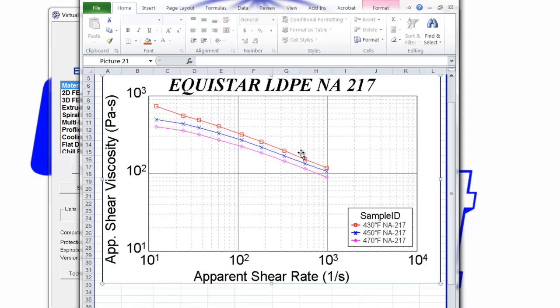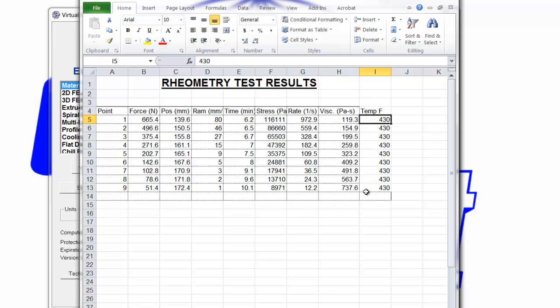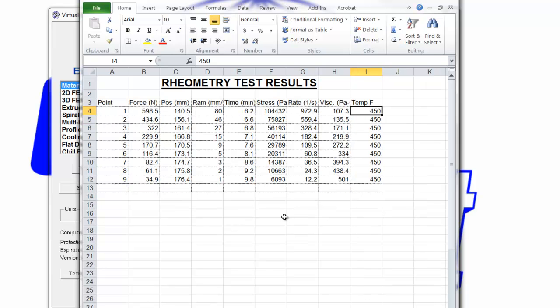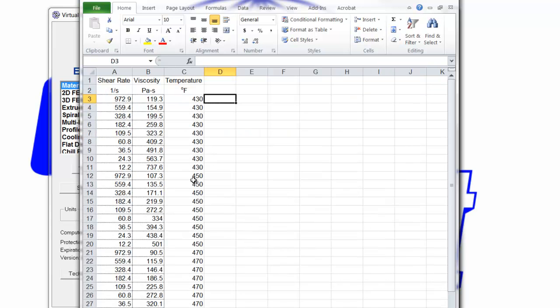While we can extract the data from the graph, it's always better to have the actual data points, as shown here in this table. The important columns are shear rate, viscosity, and the temperature that was used. So this is the data at 430 degrees, this is the data at 450 degrees, and this is the data at 470 degrees. It is easier if we take all the data and put it into three columns.